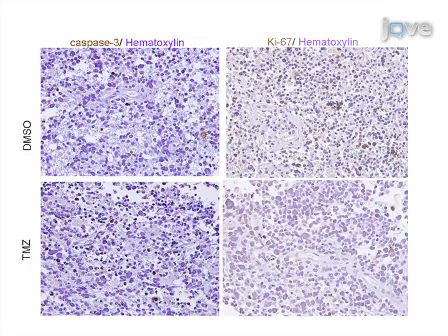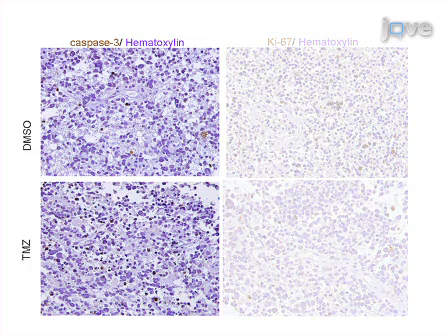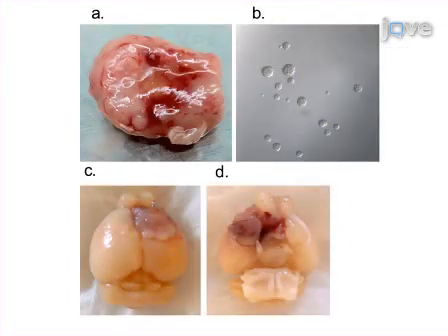In turn, immunohistochemistry with an apoptosis marker, caspase 3, did not yield any significant difference between TMZ-treated glioma specimens and the control samples. Treatment effect with temozolomide can be further characterized by combining this explant assay together with either in vitro culture or flow cytometry.